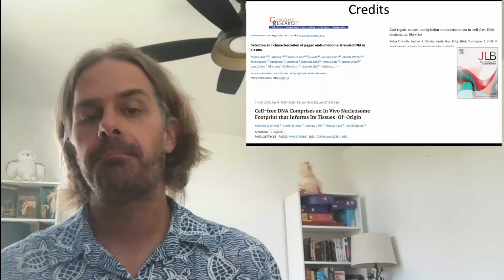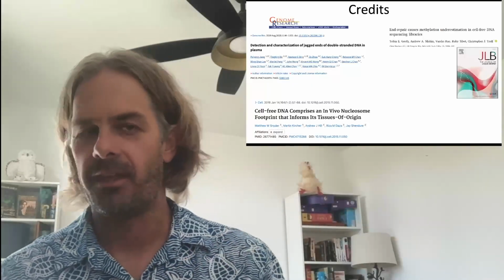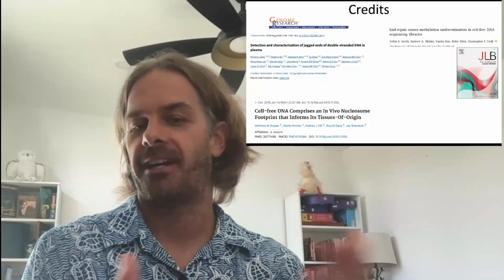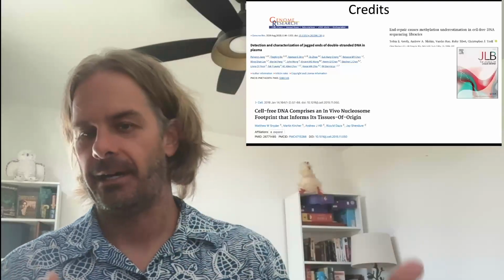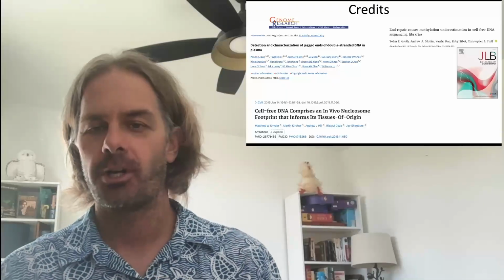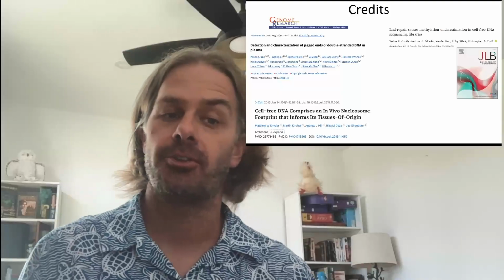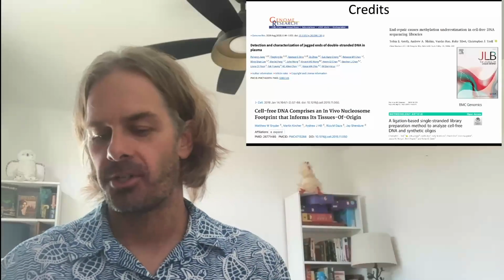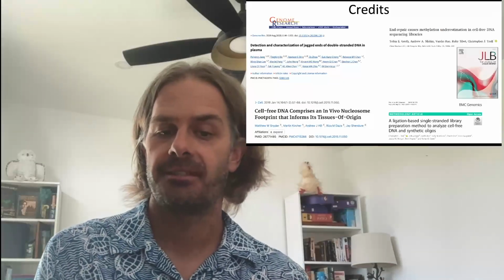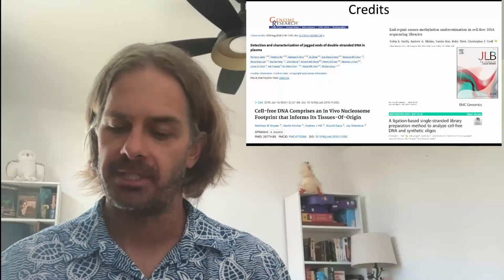And then I will plug our paper, which goes into way more detail than I did here, on how end repair affects tissue of origin, shows duplicate cell-free DNA samples, and some more results about the tissue of origin. So check out our paper in the Journal of Liquid Biopsy, and of course our initial paper, on our Claret single-stranded library prep that is used for cell-free DNA analysis.